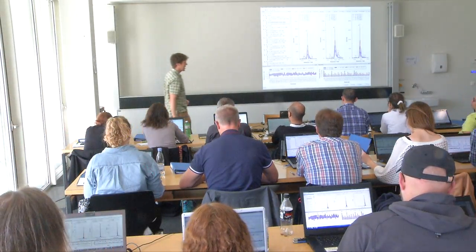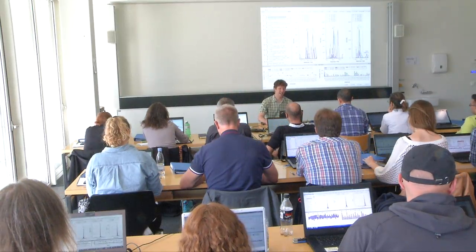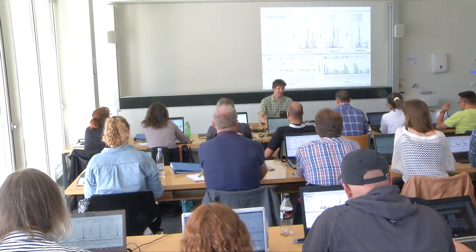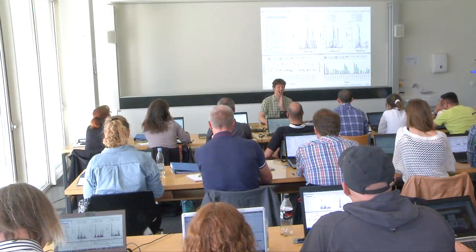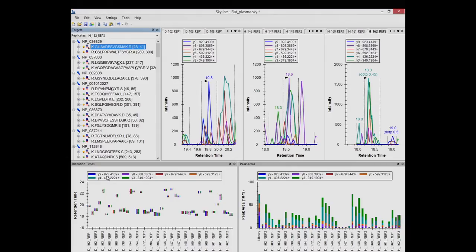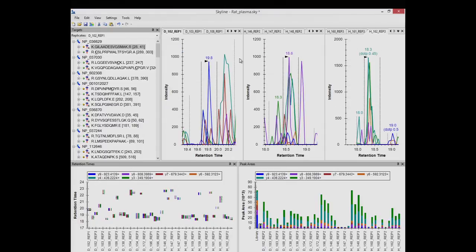So let's go up to the very top peptide. Let's see what we see. Oh, one more thing. You'll notice that this legend gets repeated a lot. We've got this legend that tells us Y9 through Y3 in 5 different graphs on the screen. So I'm going to right-click on the chromatogram graph and turn off the legend, just so that I have a little bit more space to view things. And if I ever need a legend, I can go look at these other graphs.